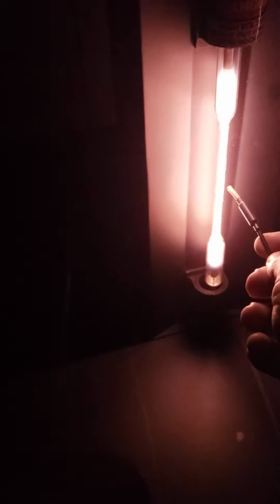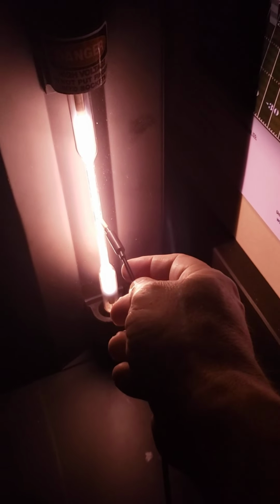So let's discard the data. And let's push play and see. Well, there it is. And I do want to just try it again, discard. Let's see if it'll give us a reading. It was working earlier. So I'll put that up here with that. Give us some graphs. My only problem is somehow, for some reason, it's not giving the graphs that it was giving earlier, unfortunately. But I'll go ahead and show you.